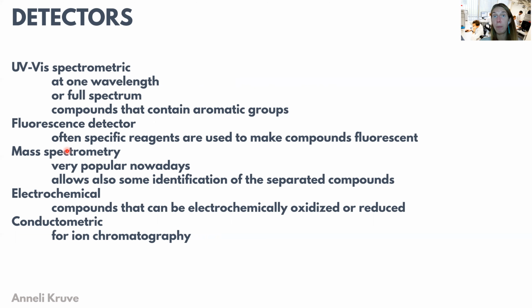So mass spectrometry definitely is applied more and more. However, there are still very many applications where the research question or the analysis question is so well defined that there isn't actually any need for mass spectrometry. This is especially the case, for example, in synthesis purity detection. In these cases, UV spectroscopy usually performs even better than mass spectrometry can. The same applies in determining the assay in pharmaceutical products, where a UV spectroscopy detector in HPLC can be used for these tasks very, very efficiently.